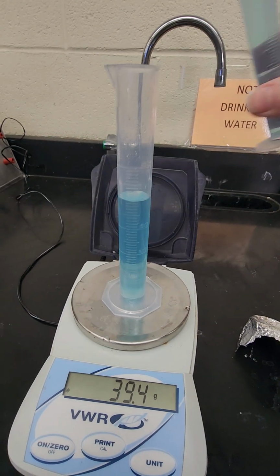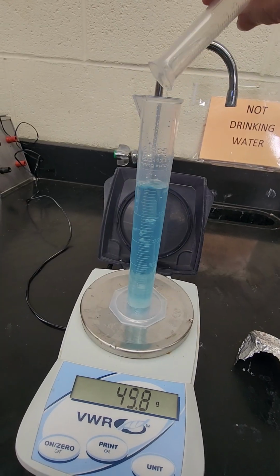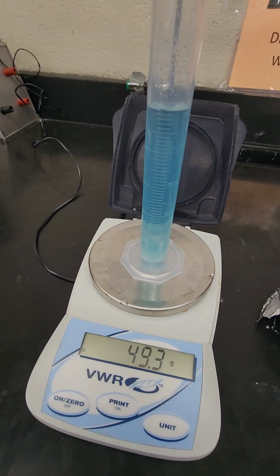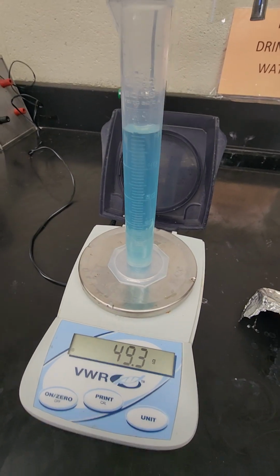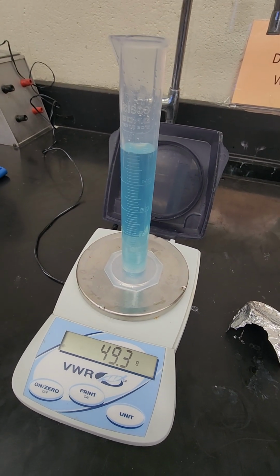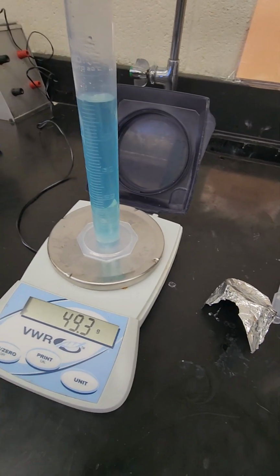And now for a total of 50 milliliters, and the mass is 49.3 grams. Once again, you're going to want to take the time to calculate the density, mass divided by volume, for each one. Okay, and I'll be back with the last liquid.